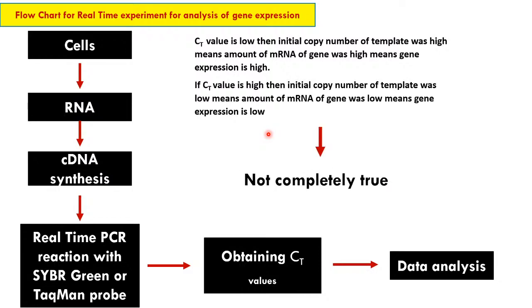But we are having a problem. That is the most complex part of the real-time PCR analysis. It looks like a simple flow chart. We are saying CT low, high expression; CT high, less expression. But that is not completely true. Reason.